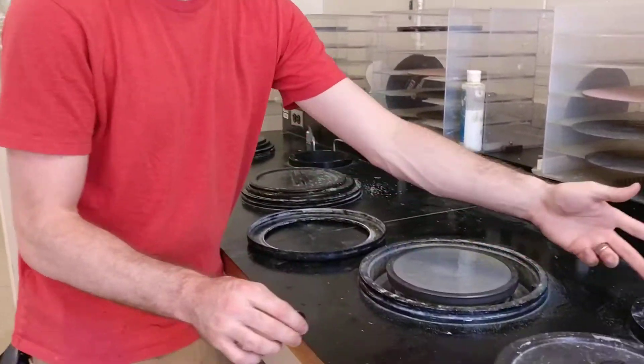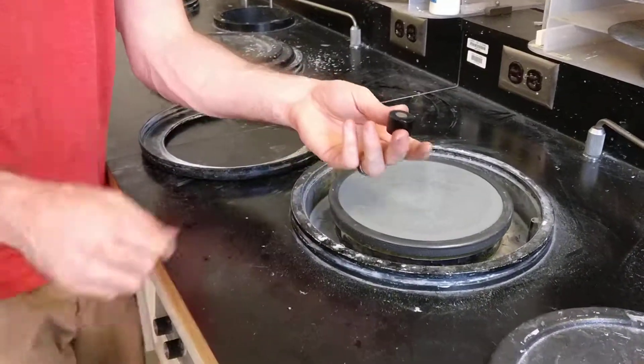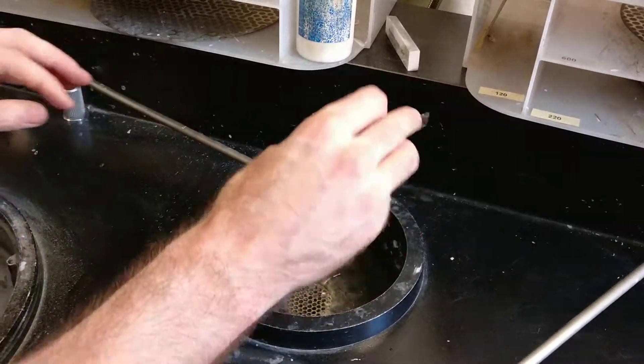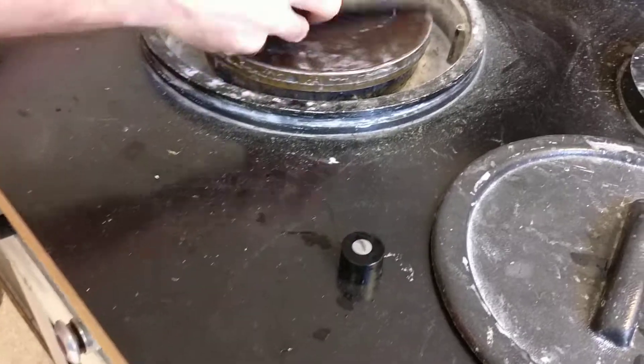Moving on to the polishing step. I'm going to rinse my sample under the sink to get any previous silicon carbide particles off the sample, then take off the paper.